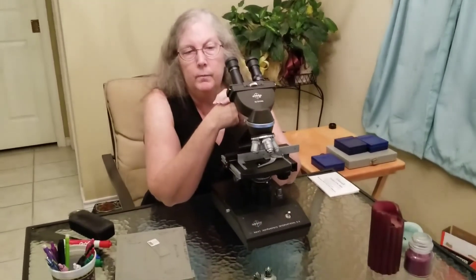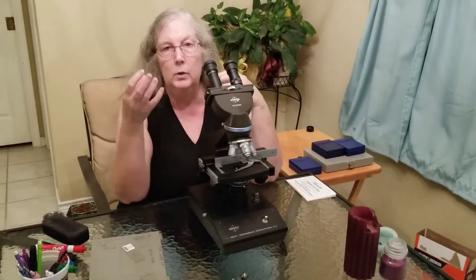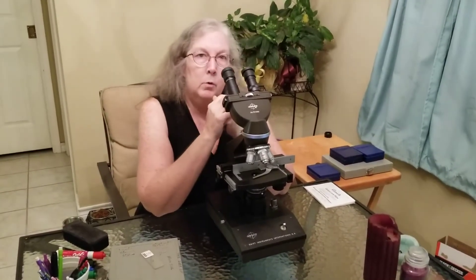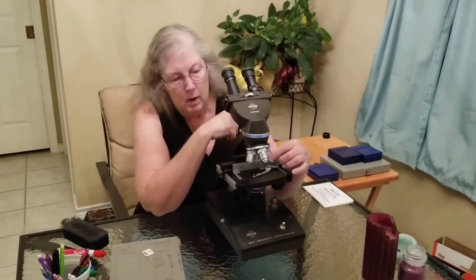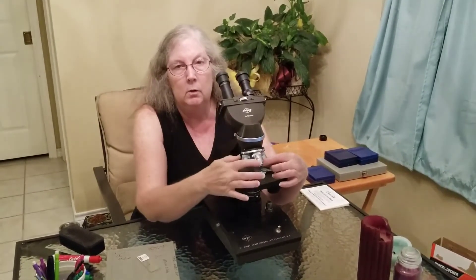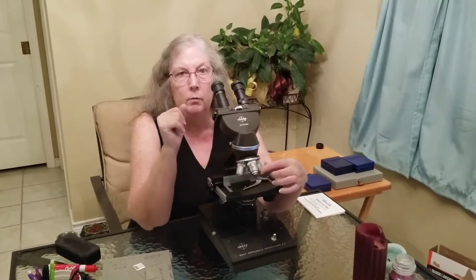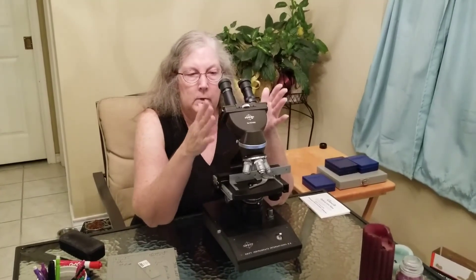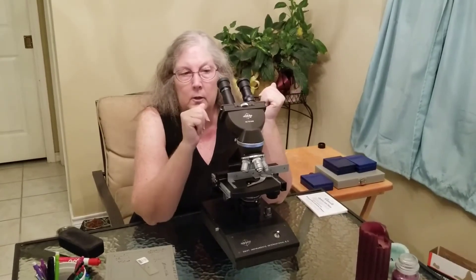Now clean the scope — clean the ocular lenses, clean the stage, and clean your objective lenses. If you have to use the oil immersion lens, which you often need in order to see bacteria, that requires you to add oil to really focus the light up. You only use oil with the oil immersion lens, and you must make sure to clean that lens off extremely well. You don't want that oil to get on any of the other objective lenses because it will actually damage them.